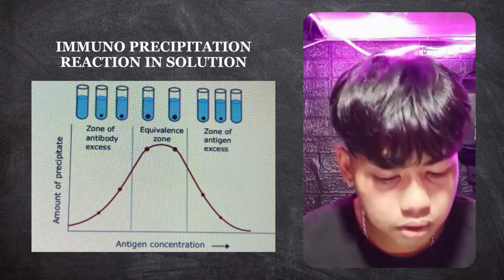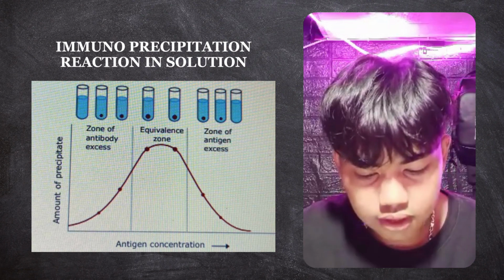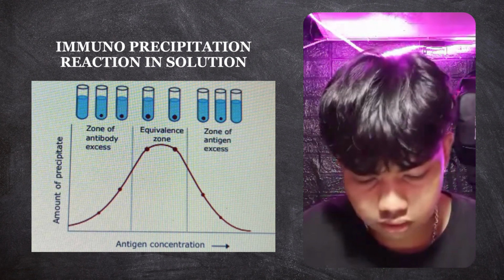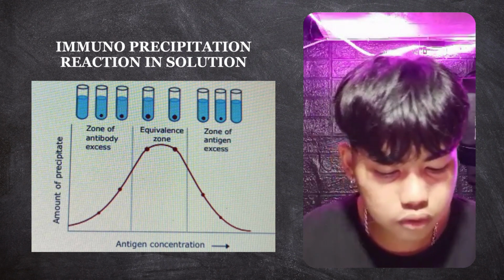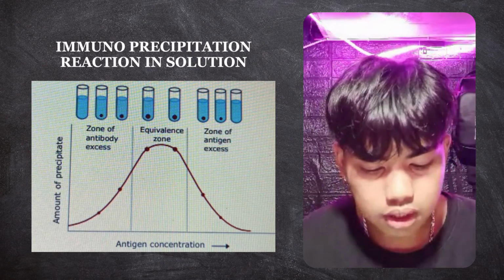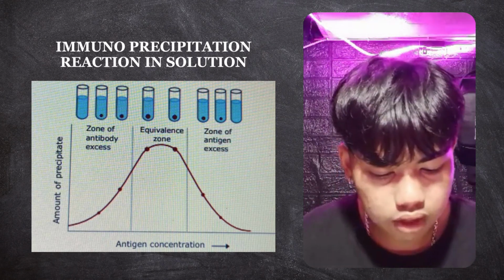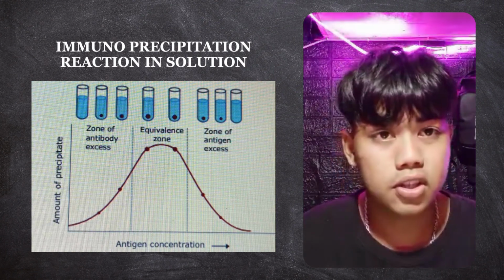For example, Coomassie blue to visualize the proteins. So next one is the Western blotting. This is optional. Following electrophoresis, proteins can be transferred to a membrane for Western blotting. This allows the detection of the specific protein of interest using secondary antibodies coupled to the detection system.